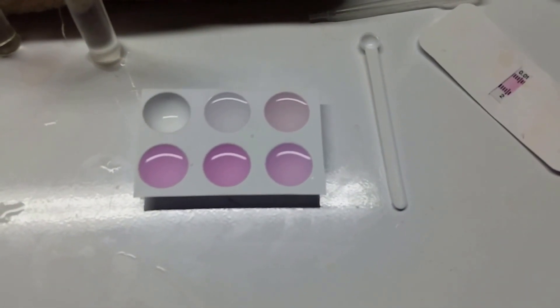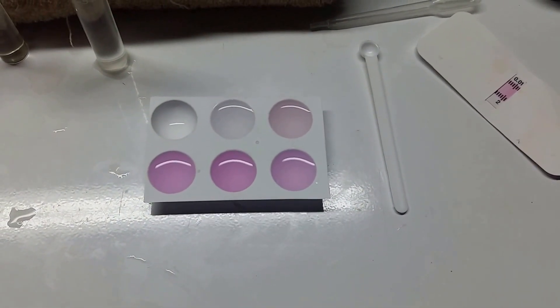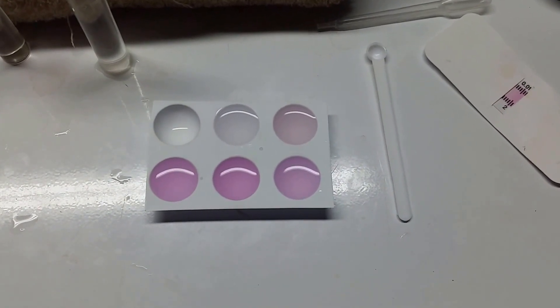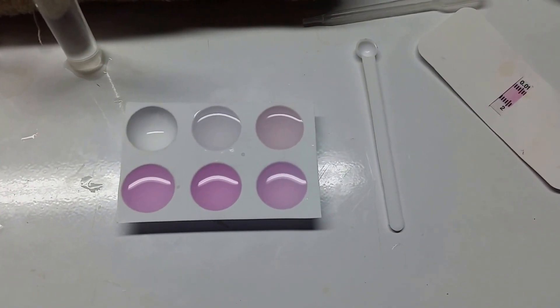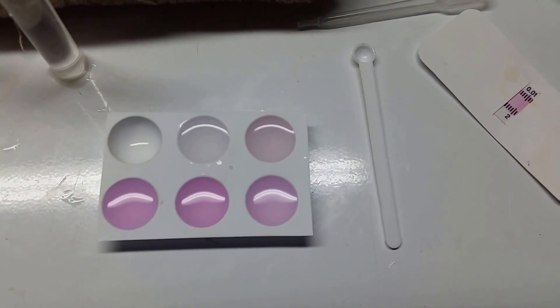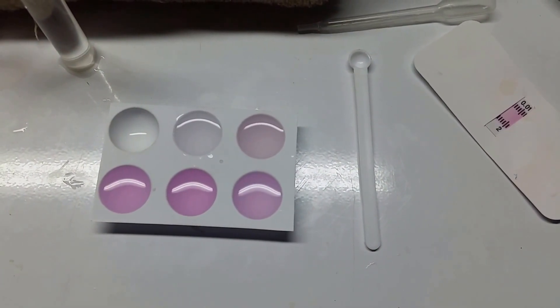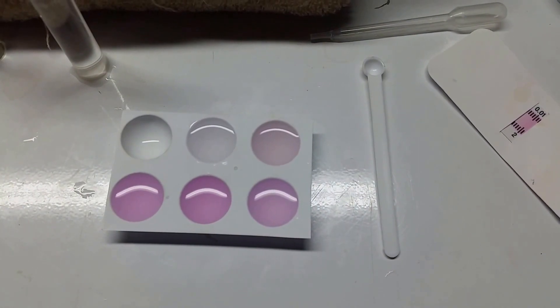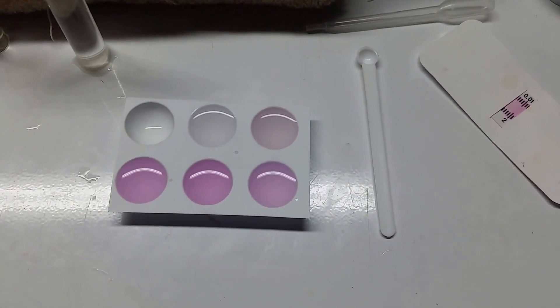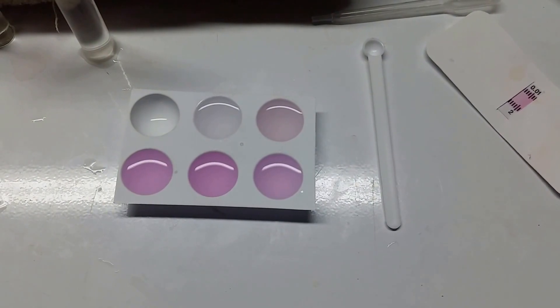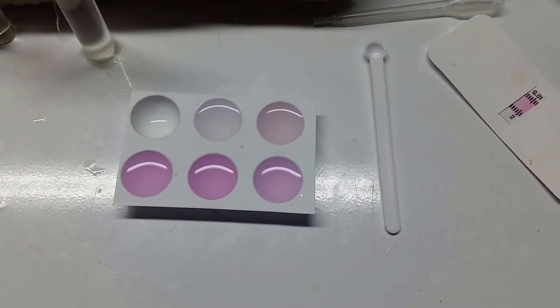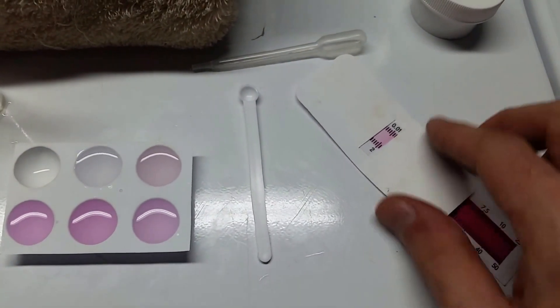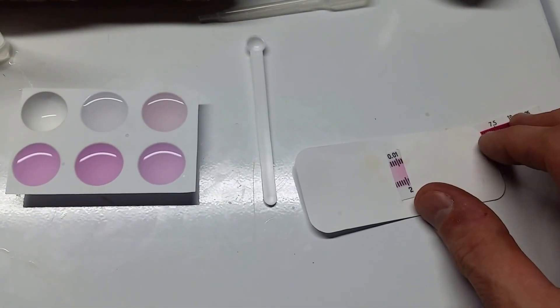The test in the top center is my source water. As you can see, these are zero nitrites - this is nitrite testing, not nitrate. The test on the top right is from one of my most established tanks, ticking over like clockwork. As I've always said, you will have trace amounts of nitrites in your tank because they're being produced in your tank and your tank has to have time to deal with them, so there's always going to be trace amounts.